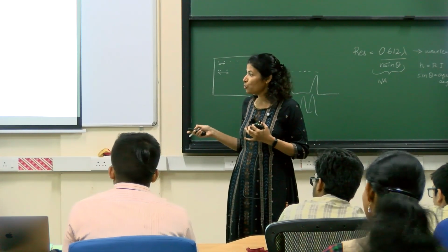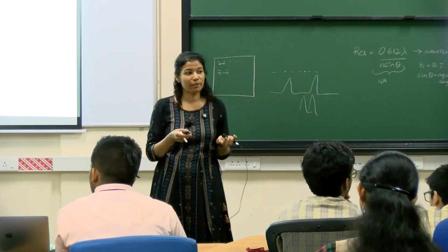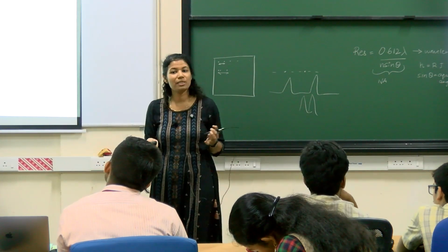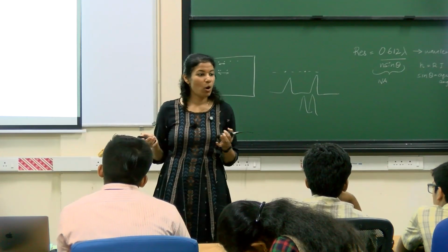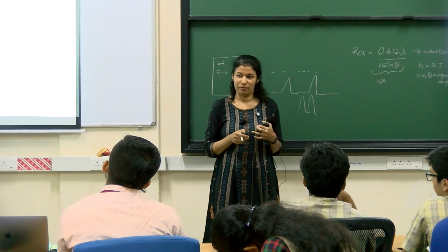One way is to use that, and the other is what we now know, the electron microscope, where you use subatomic particles. Depending on how you produce these electrons, they can have different wavelengths, but they are in the order of picometers, which is 10 to the power minus 12.